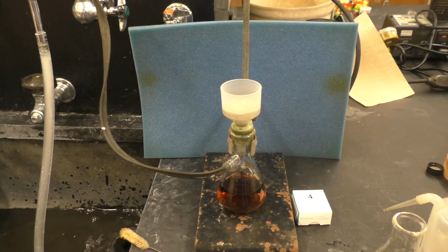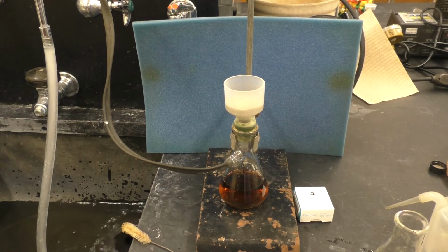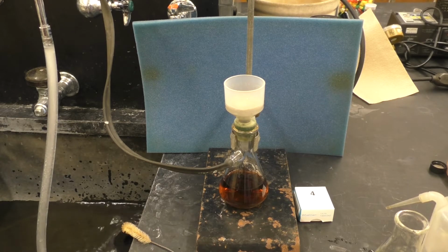So we'll pull air through this for a while, and then we'll place this in a tared beaker and put it in the oven for an additional time, just to help dry the material before getting a crude mass.